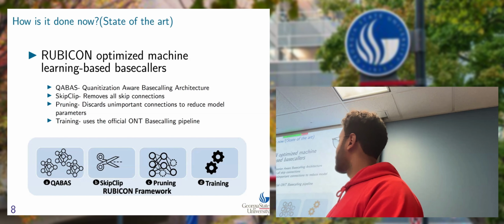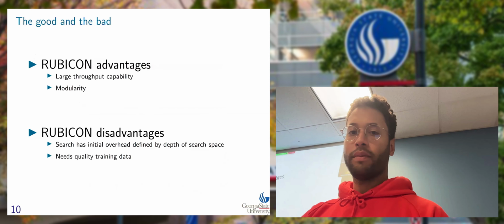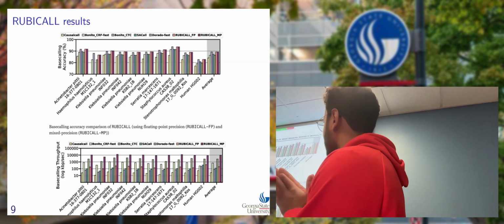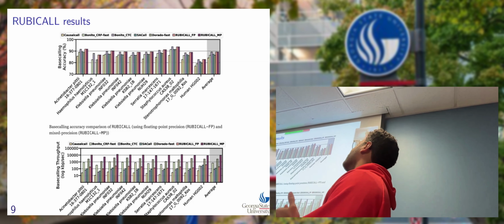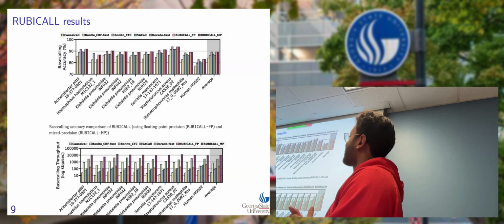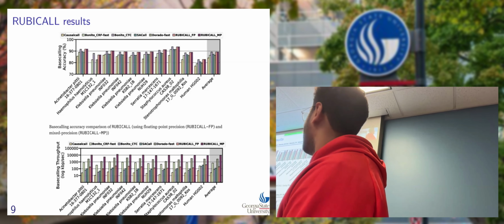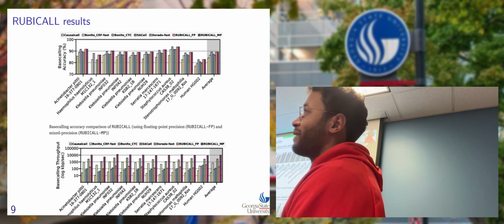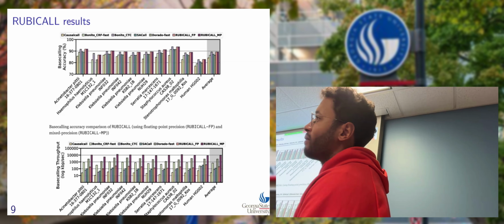Going back to the next. What is it actually? The floating point, and the... Is it precision for what? I'm going to go out on a limb here and say that it's the precision of the electrical signal. It's related to that, but not really.